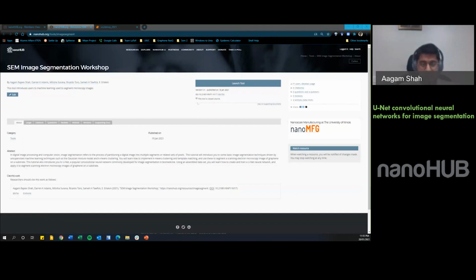So, consider the optimal number of epochs. Well, we find an accuracy that we're okay with, essentially. That's how we select the optimal number of epochs. We wait for the accuracy to go up to a value that's good enough for us, and then we stop.